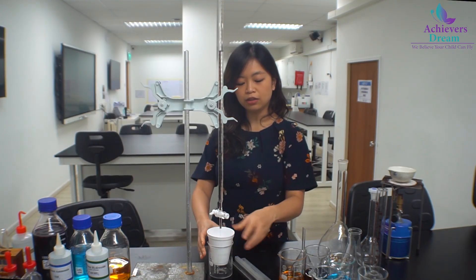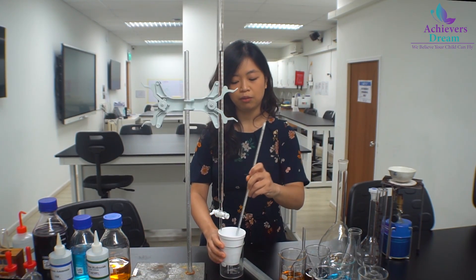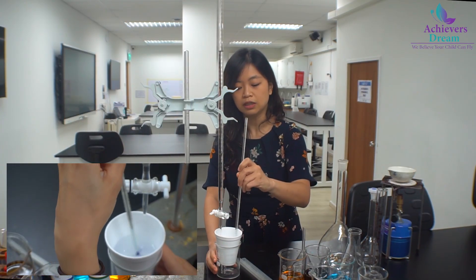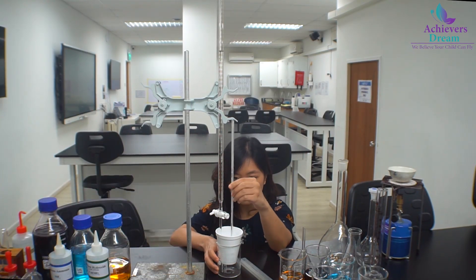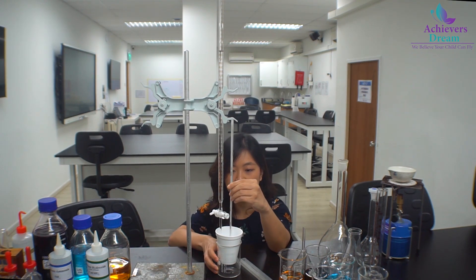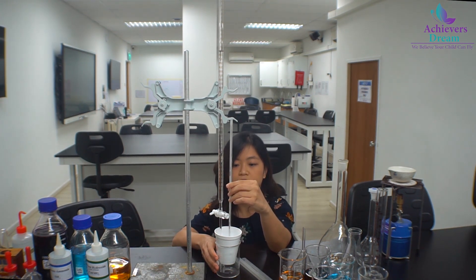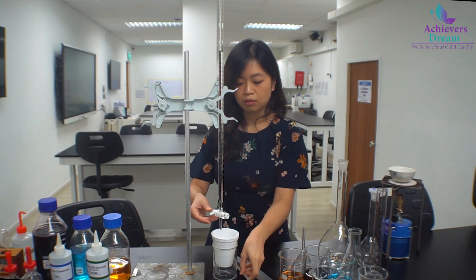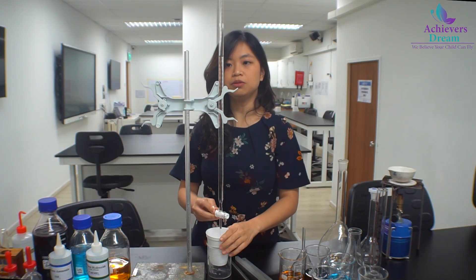As you can see, I added 5 cm³ all at once and then stirred with the thermometer to ensure it is evenly distributed. I then measure the temperature with the thermometer to see if there is any change in temperature, and I record the highest temperature that is reached before quickly adding another 5 cm³.